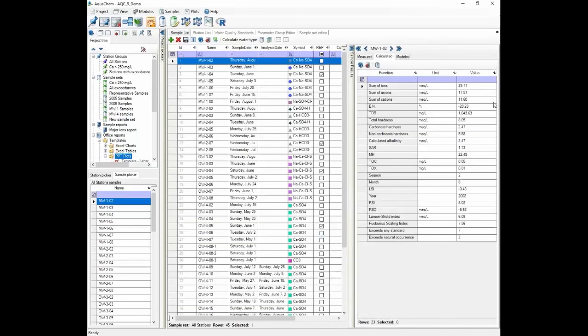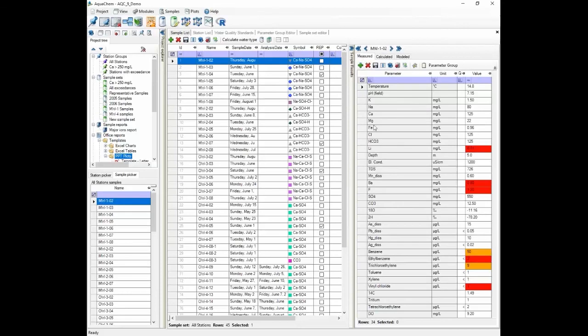Okay, so you will have to specify. So now you're thinking about, in some cases, to have in the table you may have the name like nitrate or ammonia. Yes. And not the prefix, right? It's kind of up to you how you set it up.